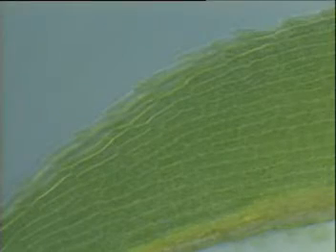This is a microscopic view of a tiny moss leaf. Just like the onion tissue, it's one cell thick.